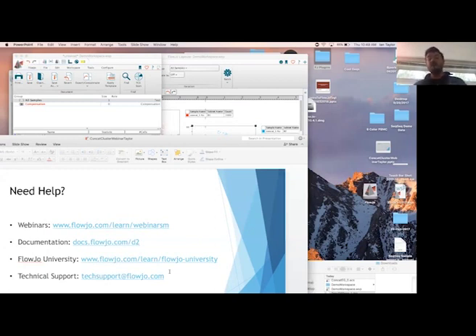So if you change that population, FlowJo has to figure out what is the new t-SNE mapping for this new set of events. So I'm afraid if that is the case, if you're changing an upstream gate, it's probably unavoidable to have to go through that recalculation. And what that means, I suppose, in terms of workflow, is that you just want to make sure that your gating is completed and correct before you run the t-SNE calculation.